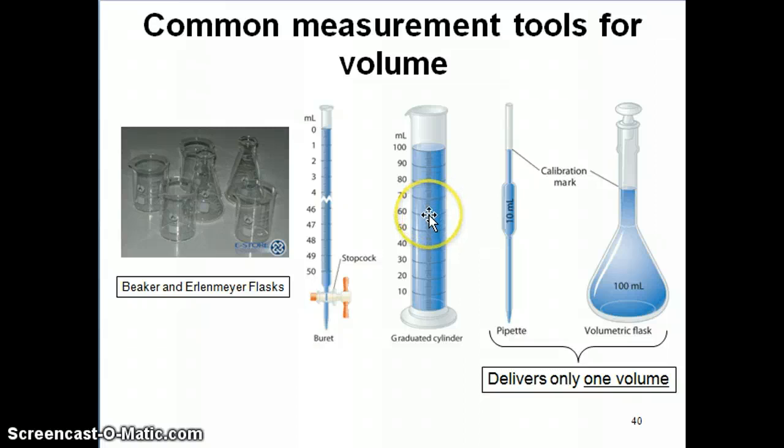The glasswares that you use to make precise measurements of volumes would be one of the following. You might use a burette. That's very precise. You might use a graduated cylinder. This is probably the one that's most commonly used. You might use some type of pipette or volumetric glassware. Volumetric pipette or volumetric flask.